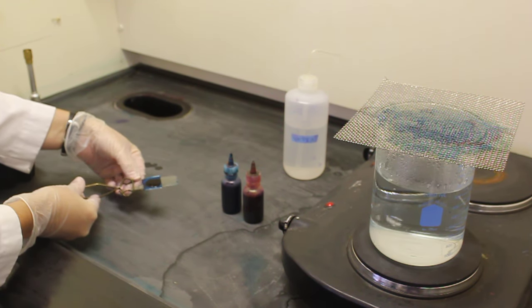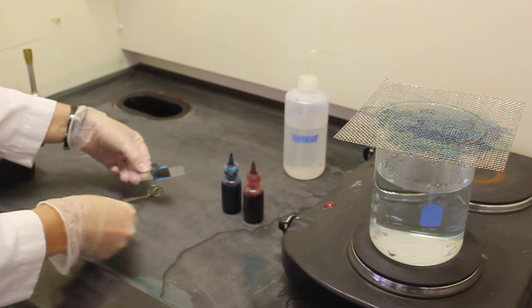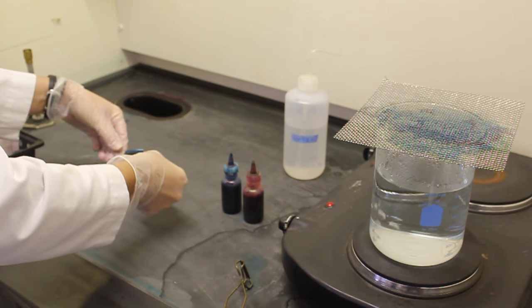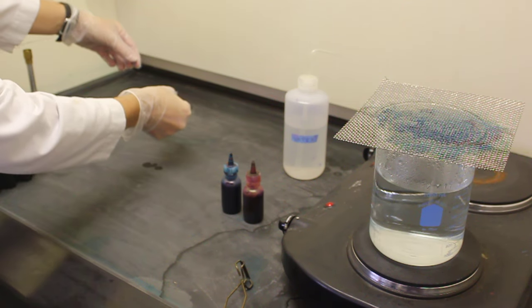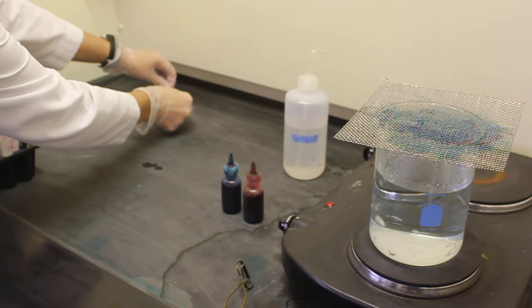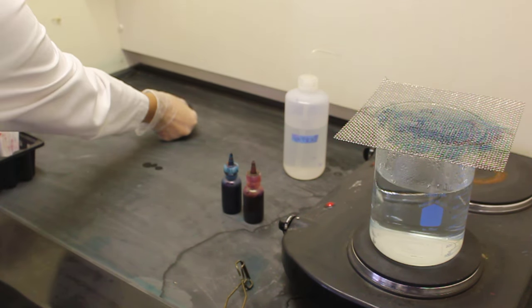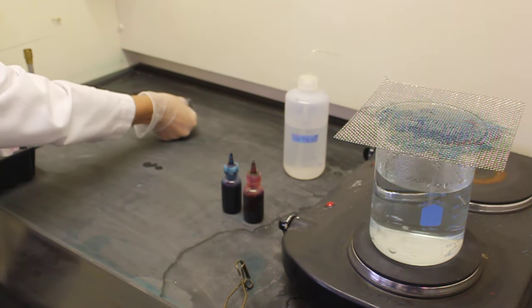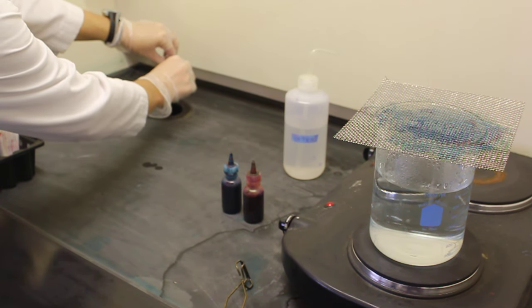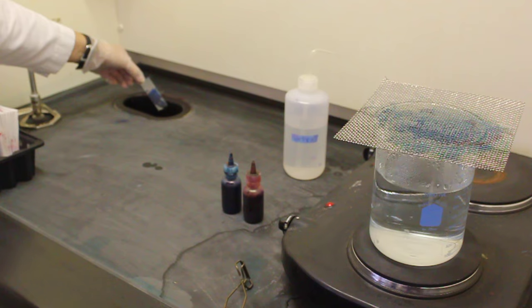Once your slide has cooled enough to touch, you then will remove your bibulous paper and throw it in the garbage bin, not down the sink. That is the end of step one of the endospore stain.